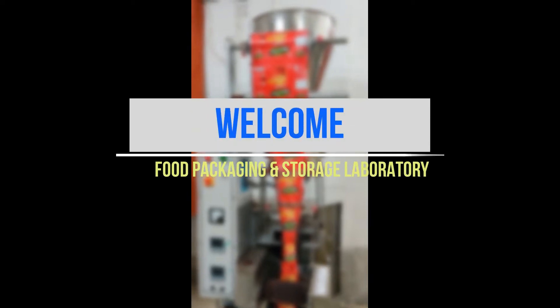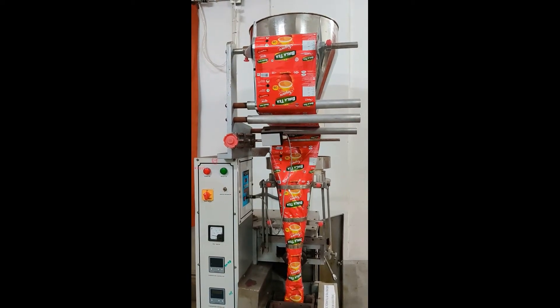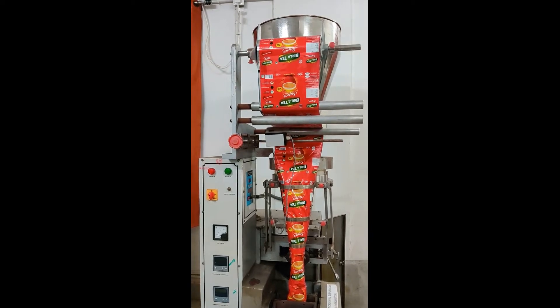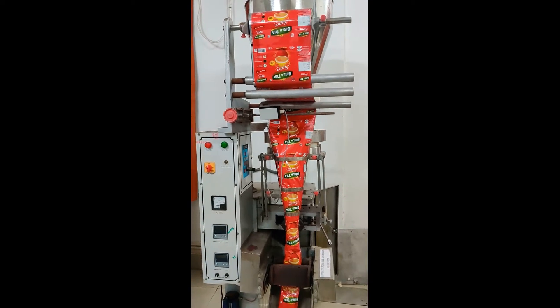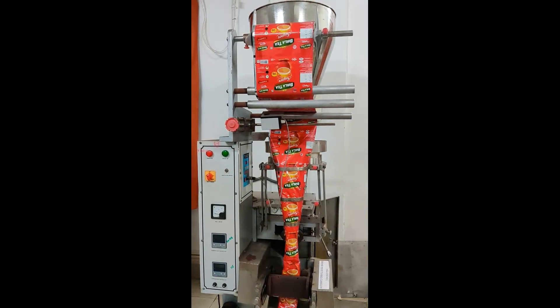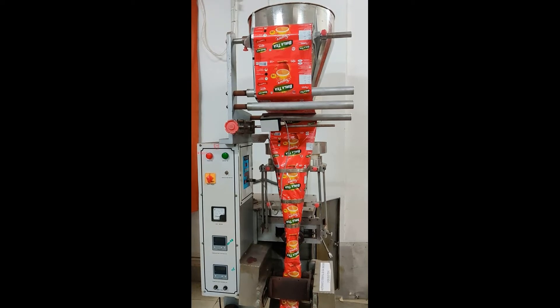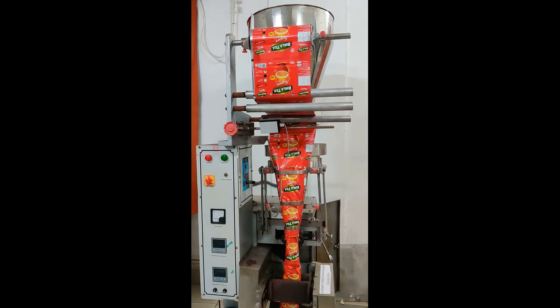Welcome to the Food Packaging and Storage Laboratory. In today's lab, we will learn about the automatic form, fill and seal machine for solid items. As we can understand by the name itself, this machine involves three major processes: first, the forming of the packaging material; second, the filling of the solid product into the packaging material; and third, the sealing of the packets to get the final packed product.